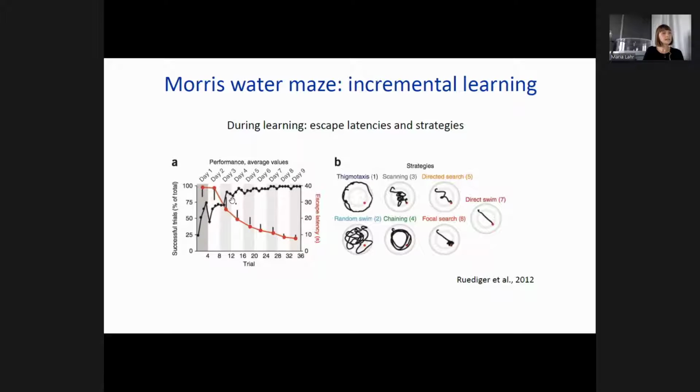And the other version, the most common version to plot the water maze data, is the escape latency that is shown here in red, where you can see how long it takes the animal in each trial to find the platform. There you can see that we are averaging all 4 trials every day because we put them into the pool in different locations.